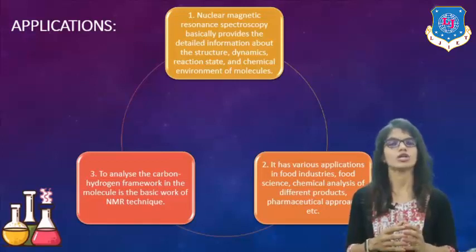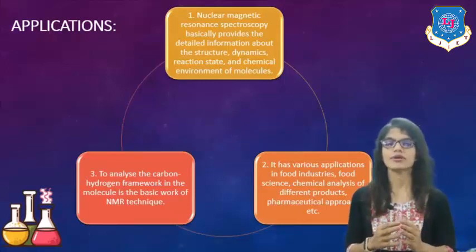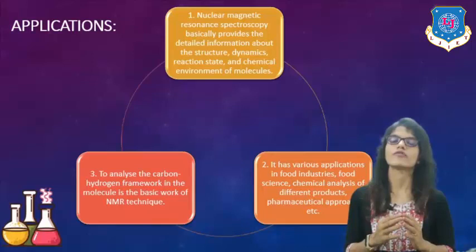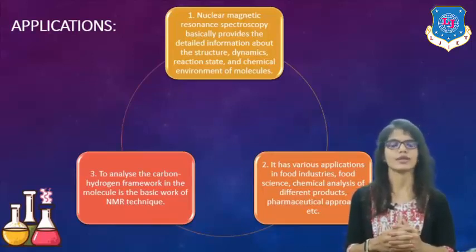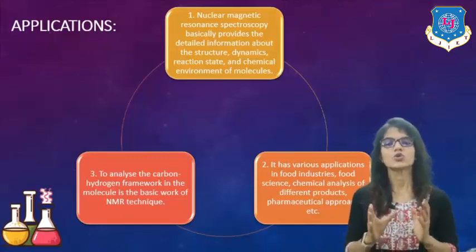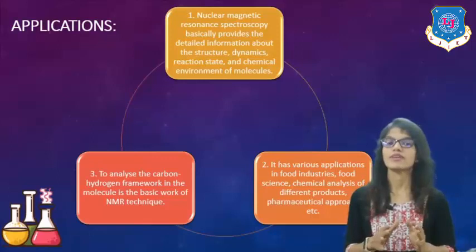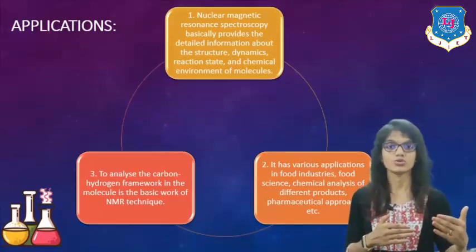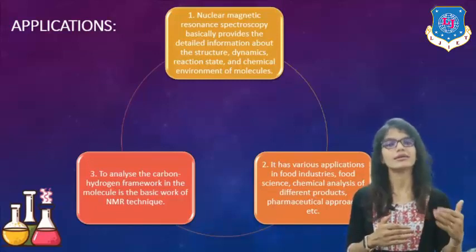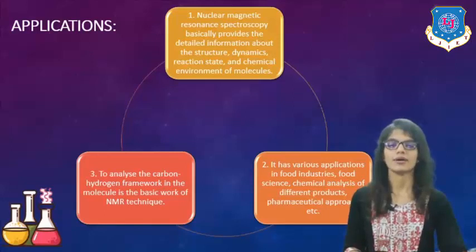Now, applications. So, nuclear magnetic resonance spectroscopy provides the detailed information about structure, dynamics, reaction states and chemical environment of the molecule. As well as it has various applications in food industry, food science laboratories, chemical analysis of different products and pharmaceutical approaches also, right? It is also used to analyze the carbon-hydrogen framework. So I can say that when we have a pure substance or a new molecule found in chemistry or in any other branch, it can be identified using NMR.